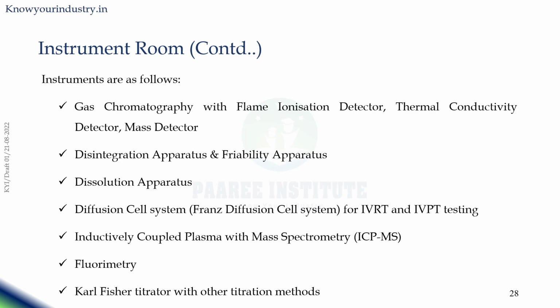Then the laboratory may contain ICP-MS, which is inductively coupled plasma with mass spectrometry, used for elemental analysis. Then it may have fluorimetry, then Karl Fischer titrator for water content analysis.